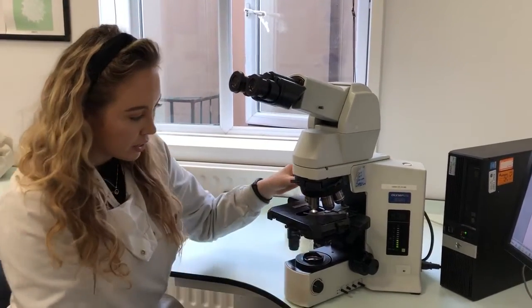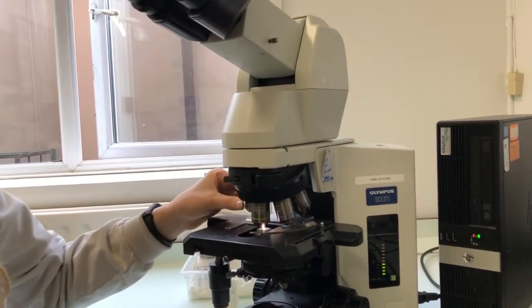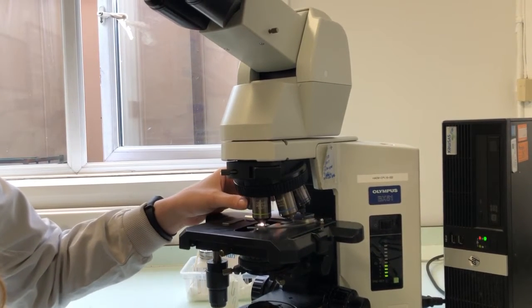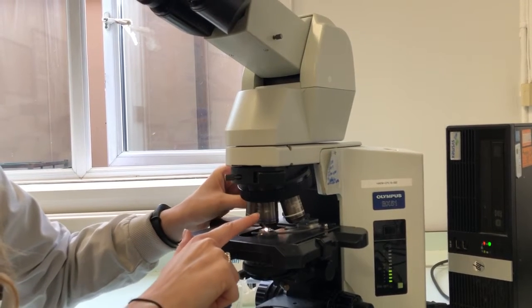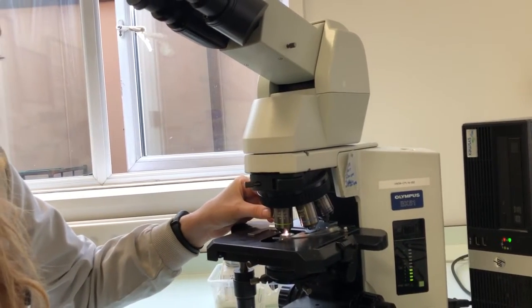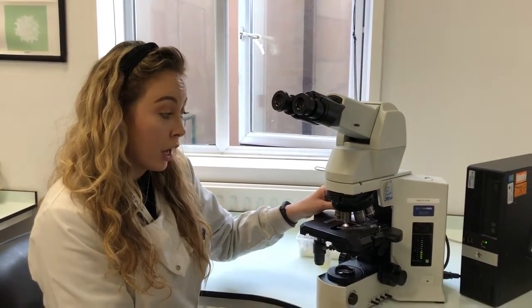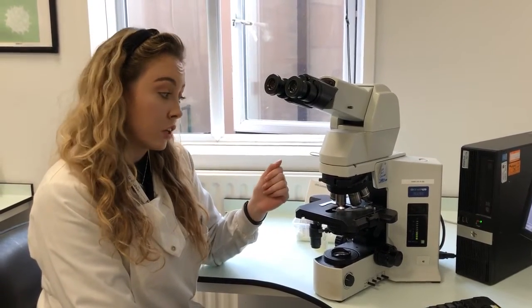This here is the nose piece, and it holds the objective lenses. We have a number of objective lenses of different magnifications. The weak ones are x10 and x20, and the higher, or strong, magnifications are x40, x60 and x100. The lower magnifications give us a broad feel for the film, not much detail, but the higher magnifications allow us to examine the blood cells under a higher magnification, and we can see the specifics and the details of the different cell types.